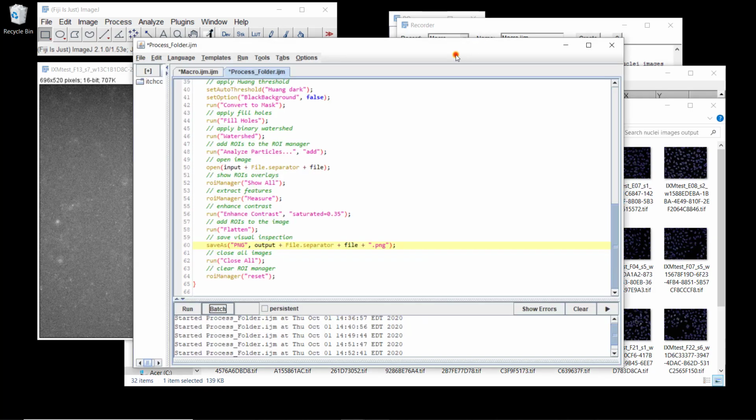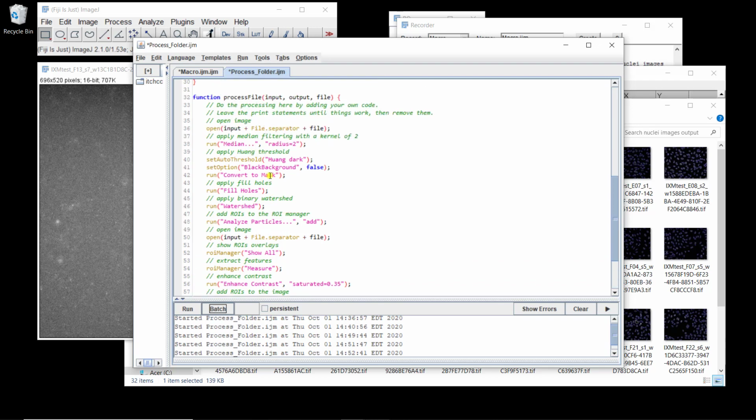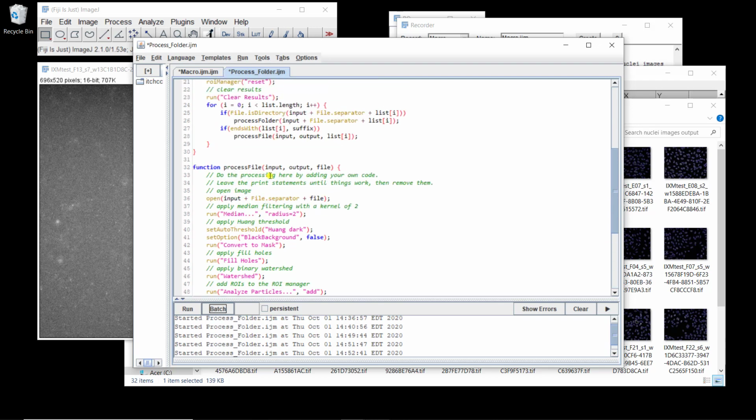So that's how you do your batch processing. So you see how powerful it is. You can obviously process a very large amount of images, which is always great. It will be reproducible because when you save that, you can even share it with other people, and they're going to be able to process their images the same way you do yours. You can reuse, for example, the pre-processing, if you want to do the same thing for another application, you can go back here and just copy and paste.